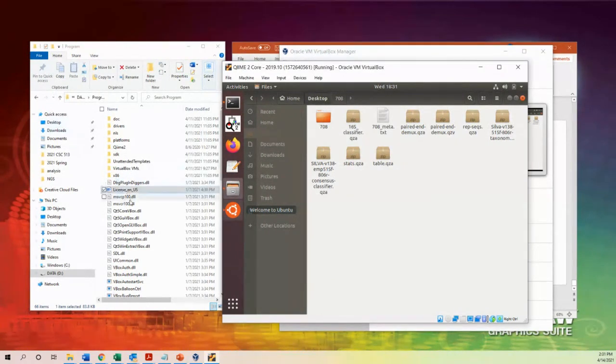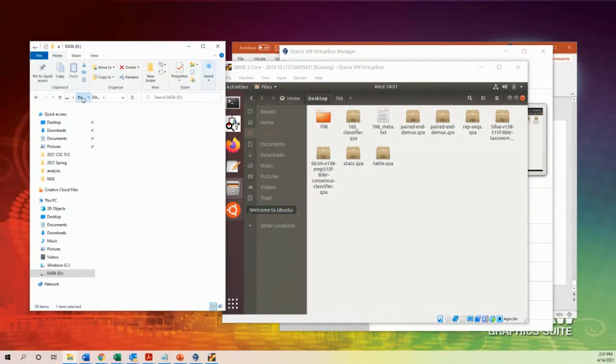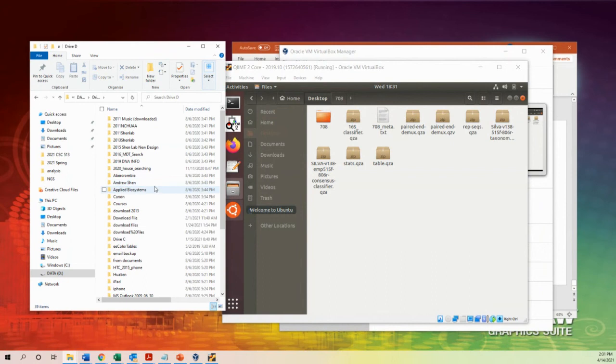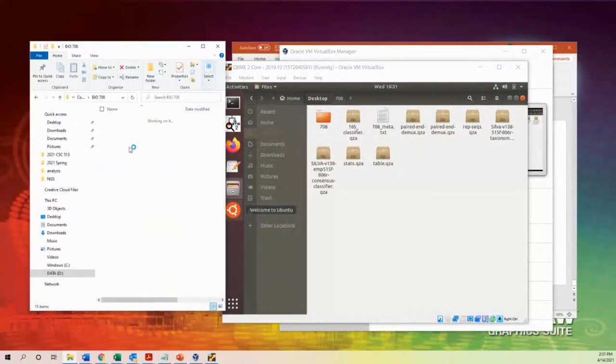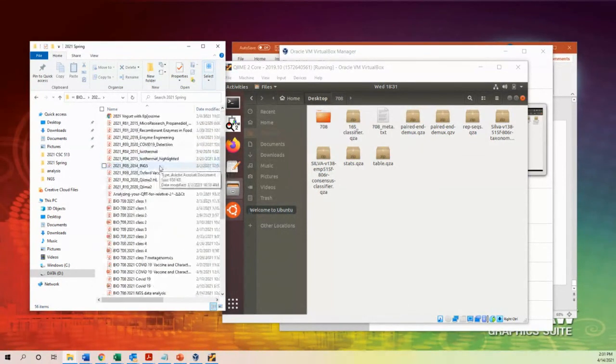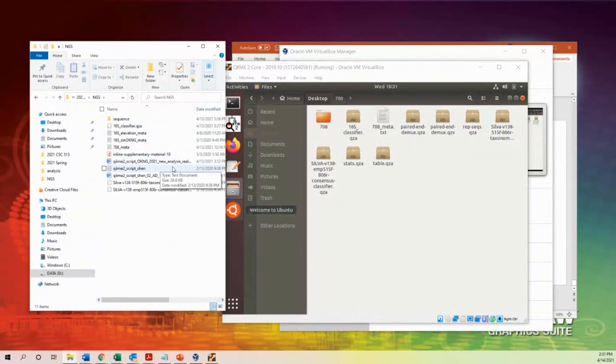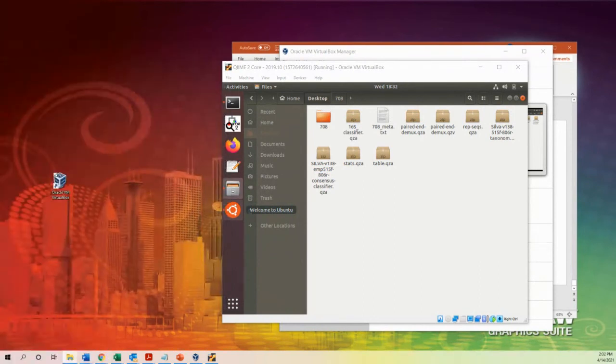To start the analysis, let me see. Did I give you the 708 script?